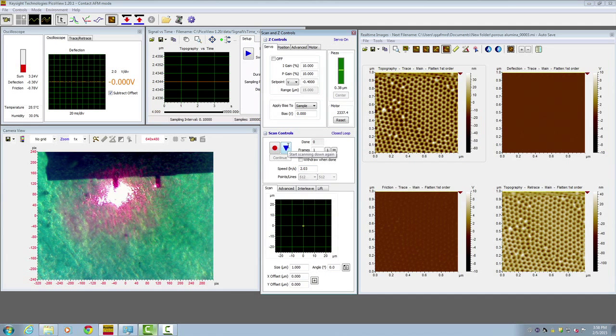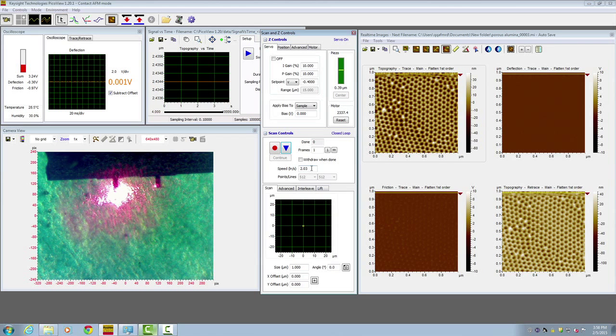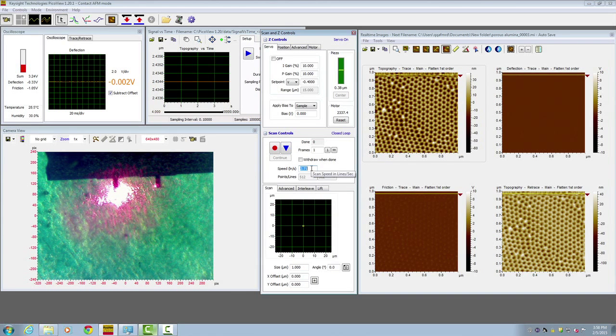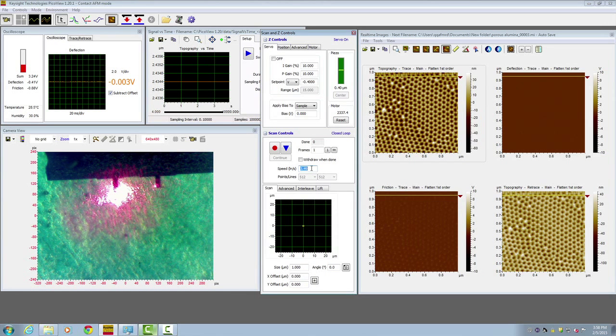Click start and the image starts to appear. You can adjust the speed and integral gain during the imaging.